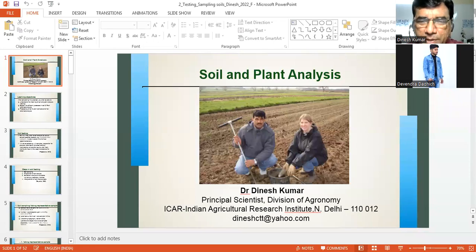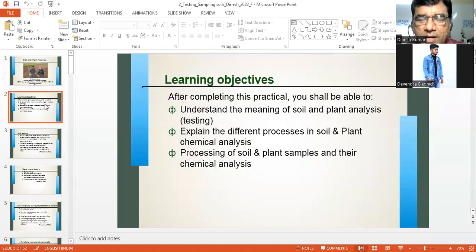I'm really very happy to discuss with you soil and plant analysis. The learning objectives are to understand the meaning of soil and plant analysis testing, explain the different processes in soil and plant chemical analysis, processing of soil and plant samples and their chemical analysis.